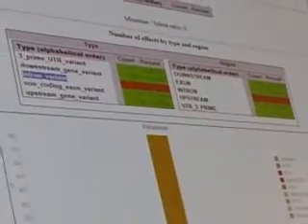I'm sorry, what now? On the figure, you have two exon? Yeah, why did you put all this? This is generated by SnpEff. I know why you put the... I don't know. Who wrote it? SnpEff. But that's what he's done. Yeah, I very rarely look at the changes and so forth.